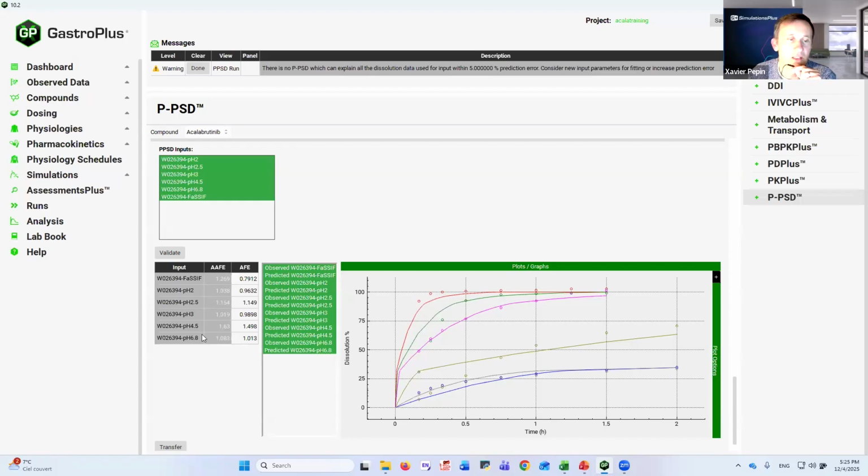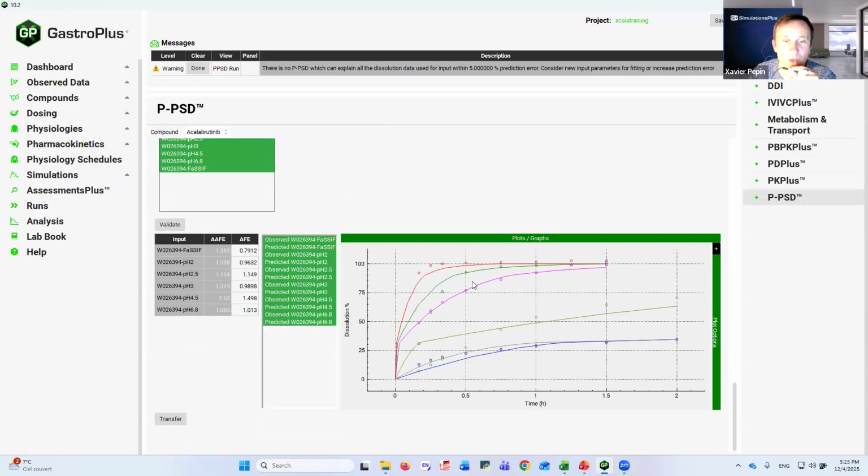I think at this stage you need to have a discussion with your analyst, and I'm sorry there was no analyst today for this webinar, but if you meet your colleagues, you can discuss this with them, because you have to weigh in the trust you have in your input data. But over the rest of them, between pH 2 and pH 6.8, we're doing a good job, less than 20% error. So let's transfer that P-PSD.